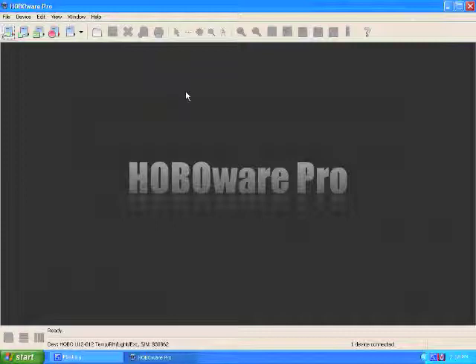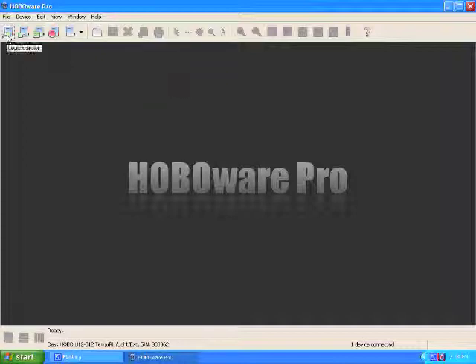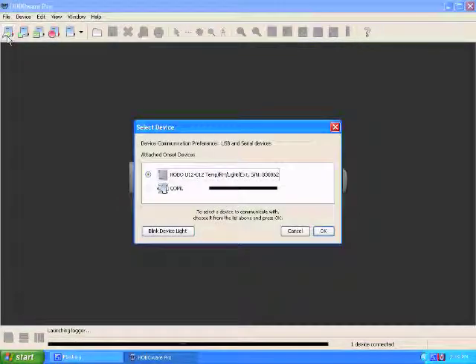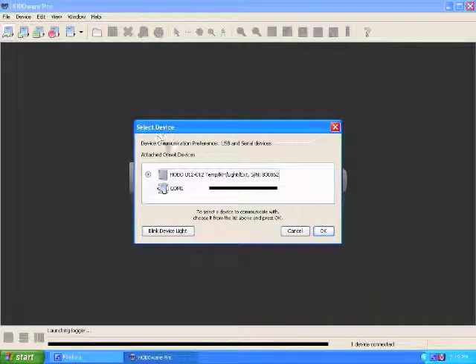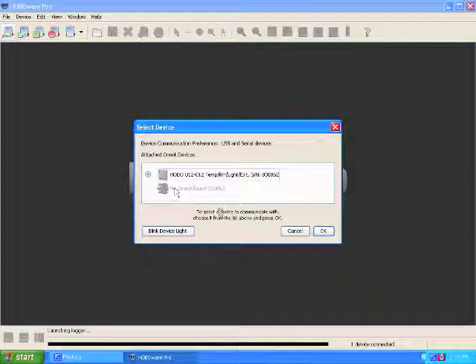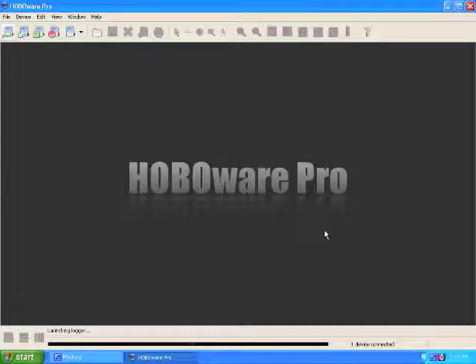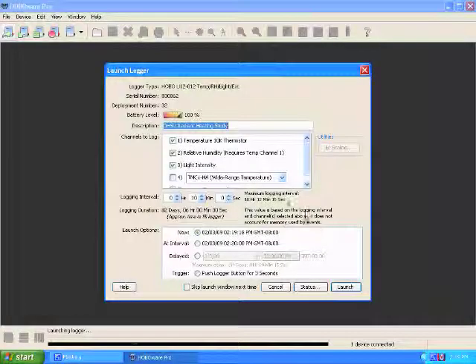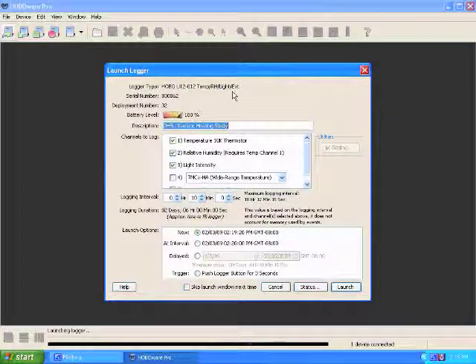This is your basic function screen when you open up HoboWare. First, plug in your data logger and then choose Launch Device. It will automatically detect if you have anything connected yet. See, it's found my U12. And this is the user interface for your Hobo. It has everything that you need to launch it.